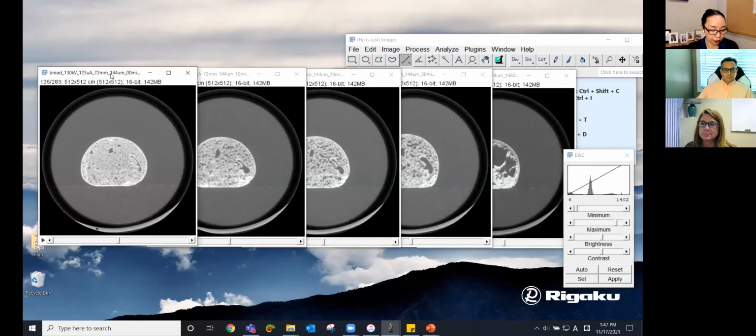The first one is the scan I did right after I prepared the dough and shaped it into a small dinner roll size. I left the dough inside of the machine and it kept running scans all the way to the next day. So that's what you're looking at, the dough changing over time. What we want to do here, this is a 4D CT, a time resolved CT scan, and it's probably convenient to put everything in one stack so that you can scroll through different cross sections.